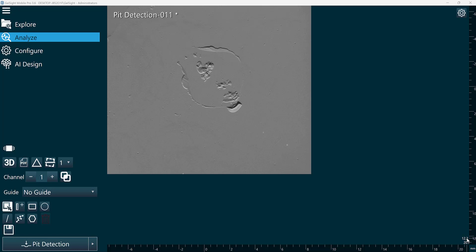In this video, we're going to walk through how to use the pit detection function. Pit detection can be used to characterize multiple negative defects or features for applications including corrosion.